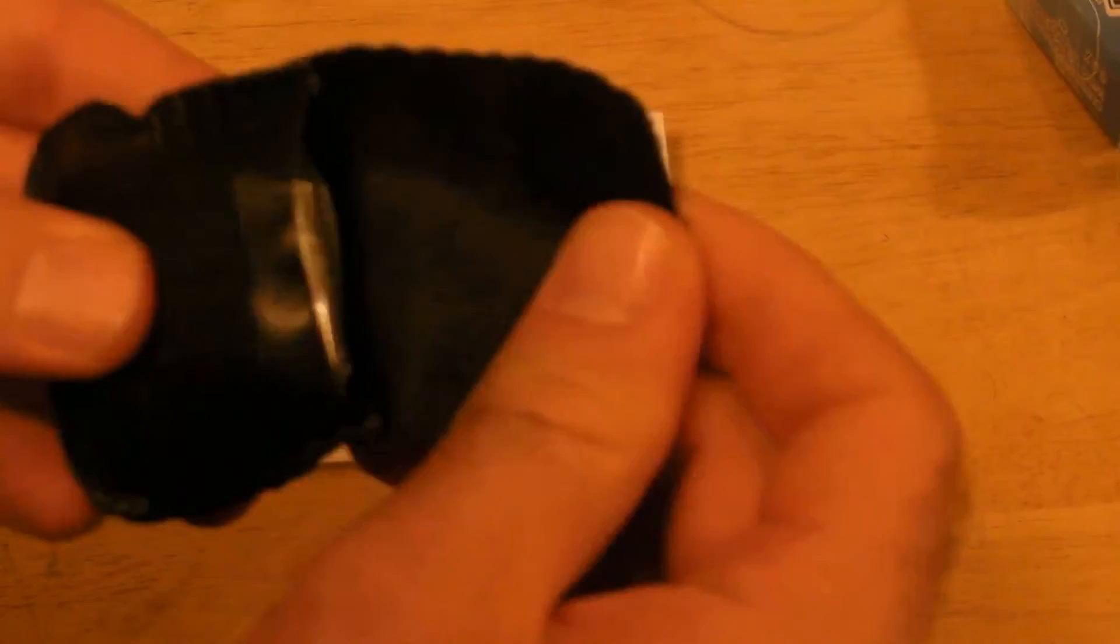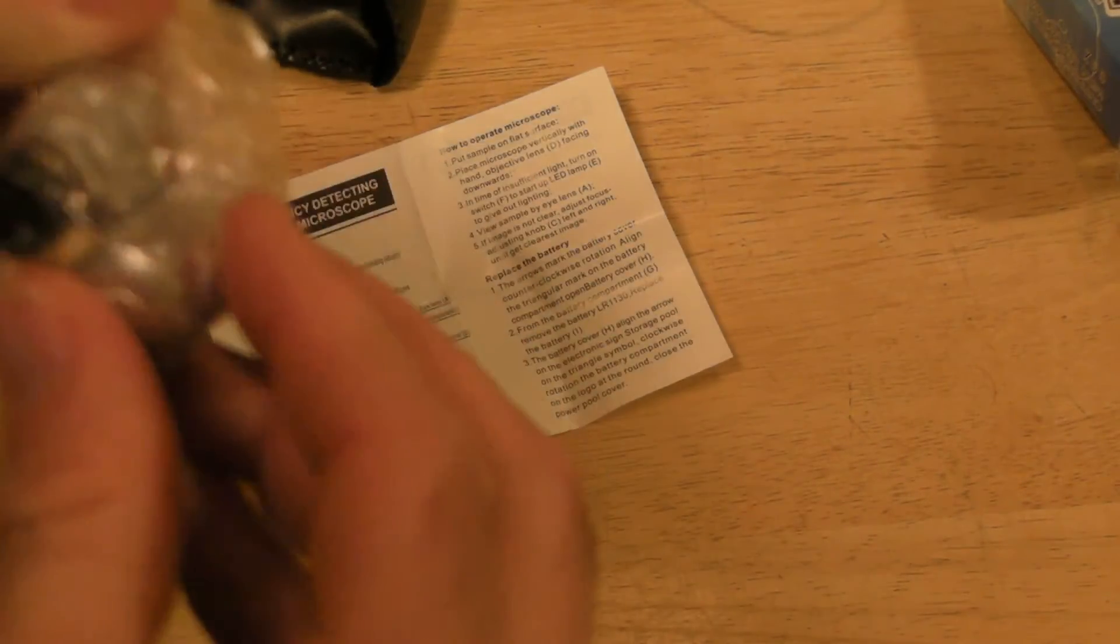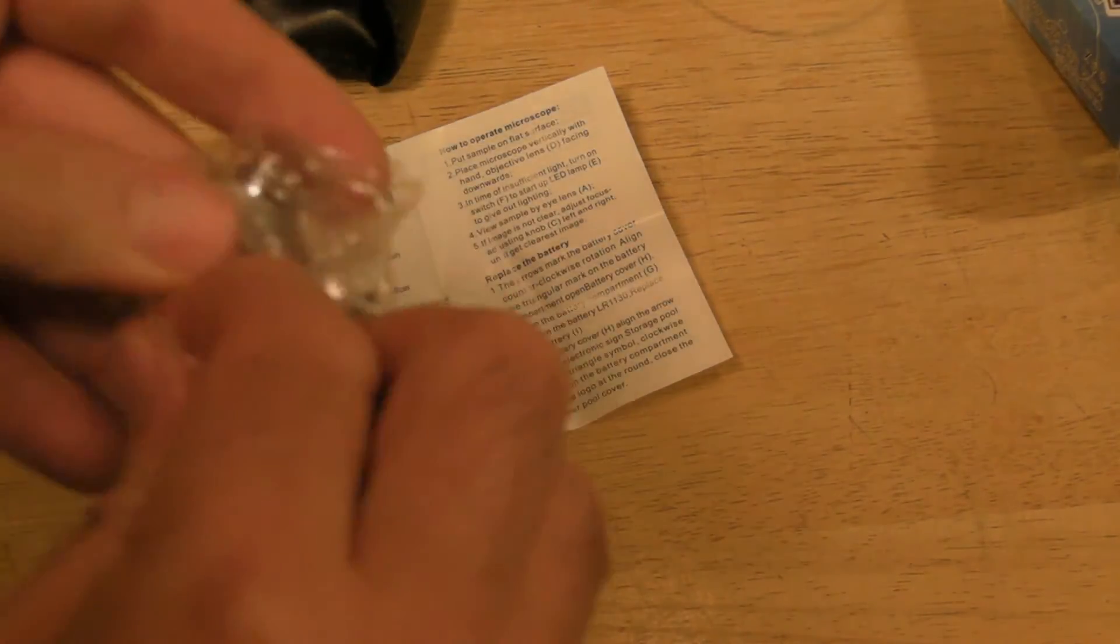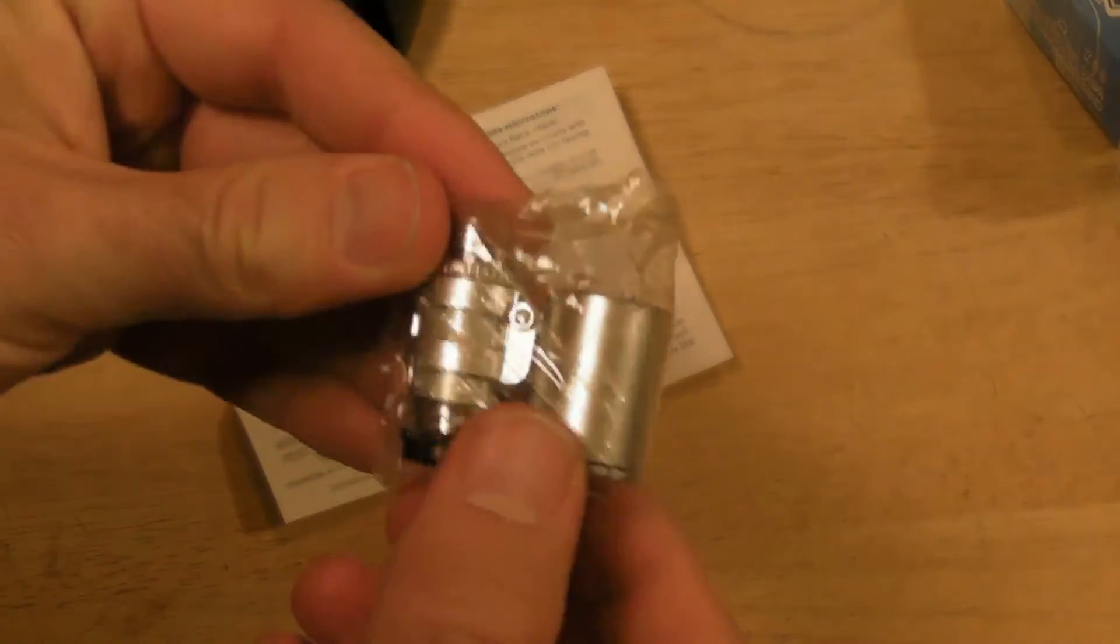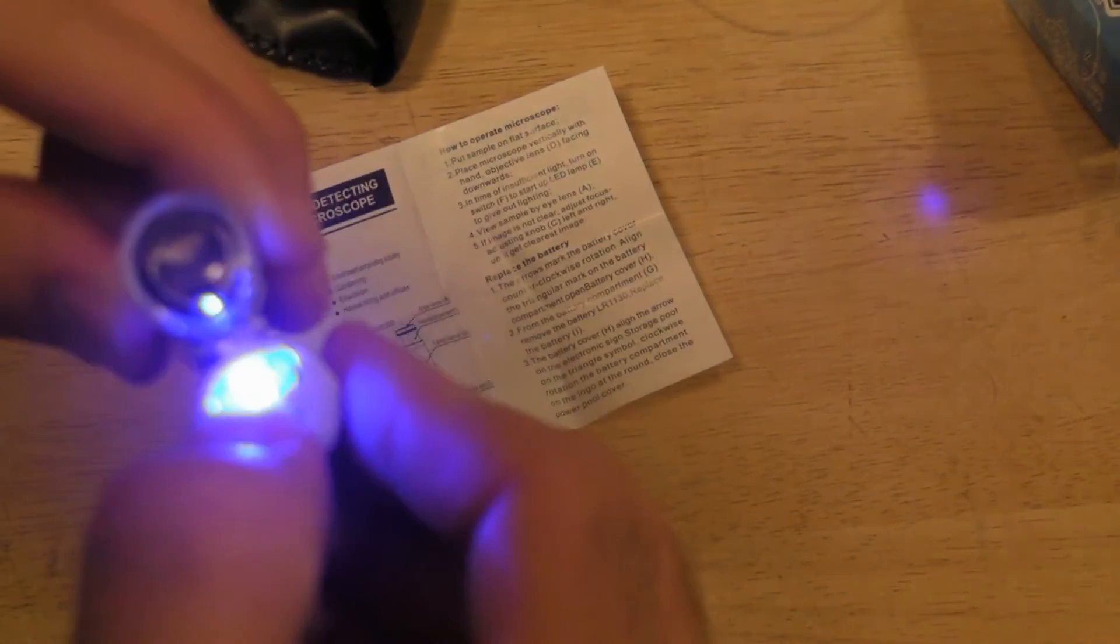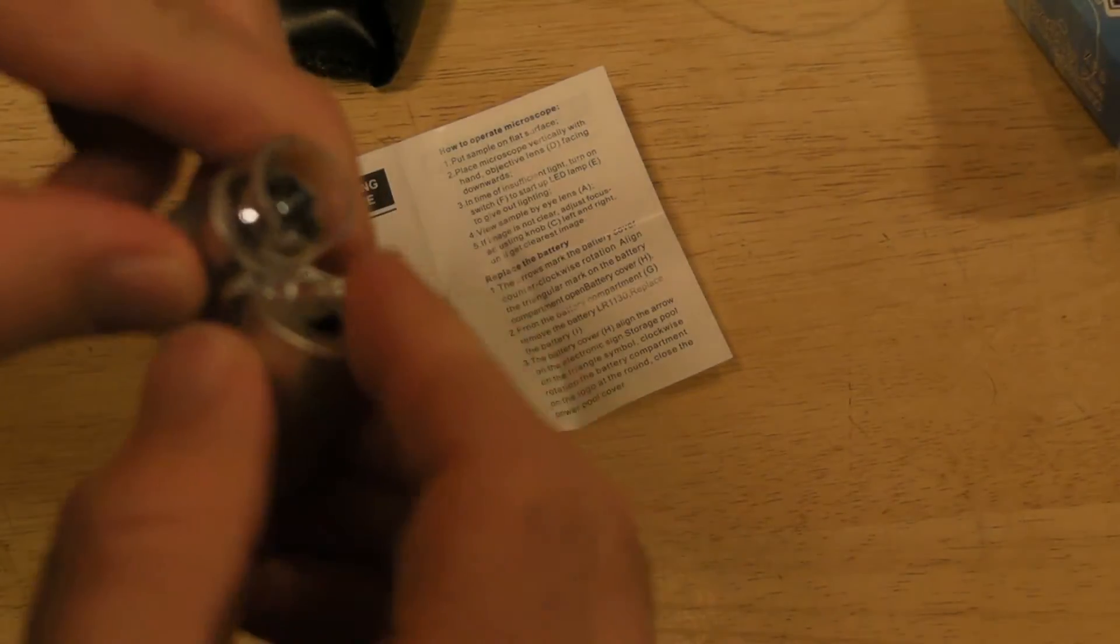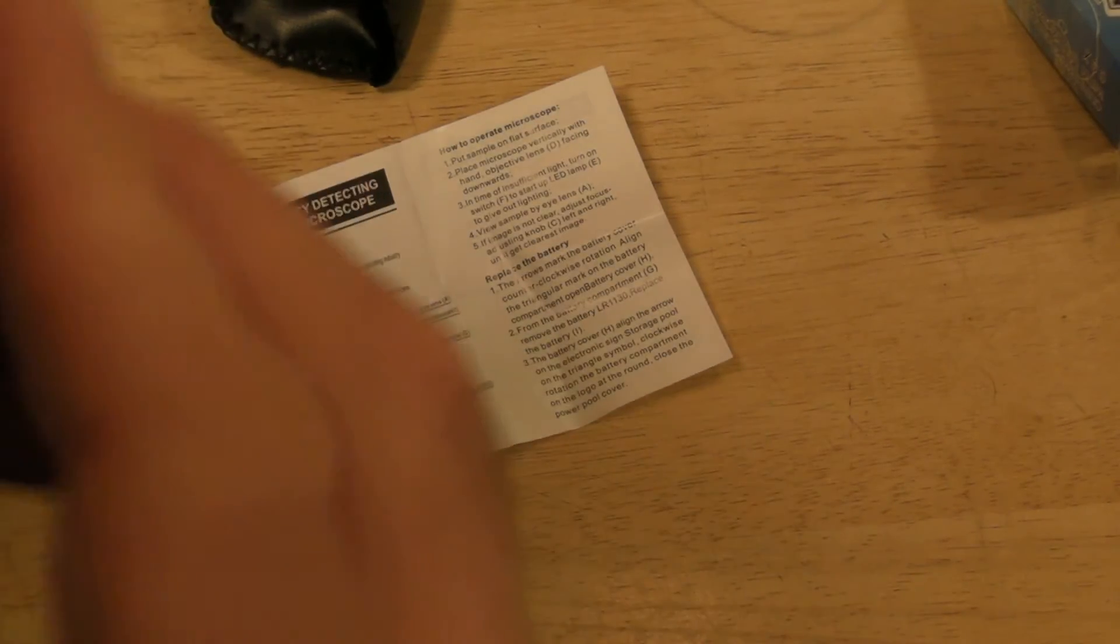Alright so it has a little instruction booklet and a little fake leather pouch with velcro and here is the mini microscope. And it comes with batteries even. Wow that's pretty cool.